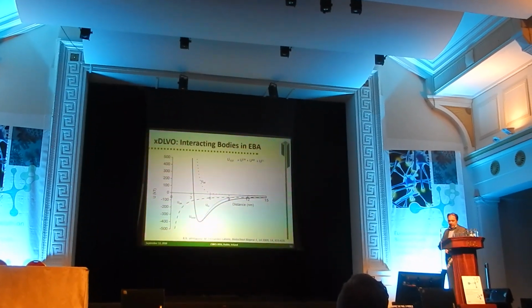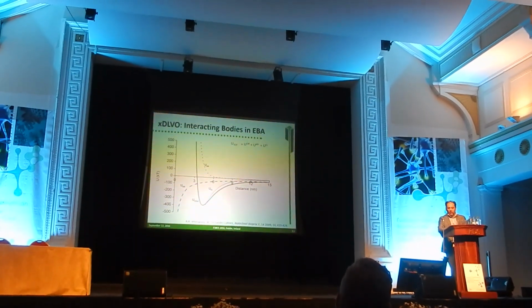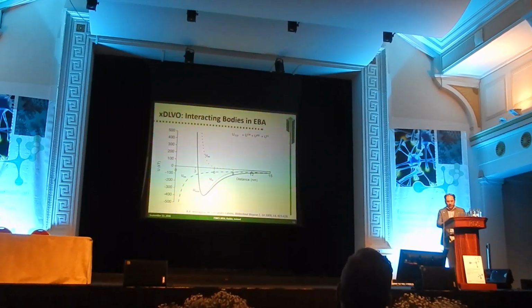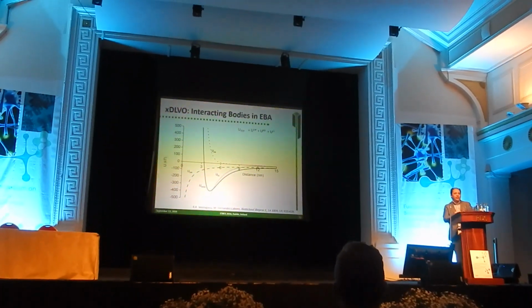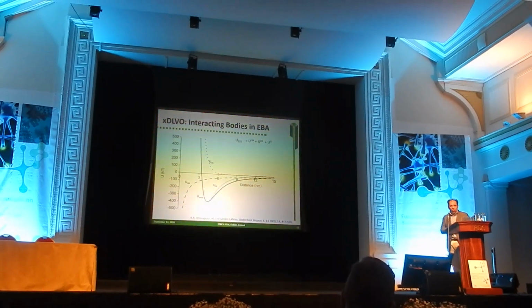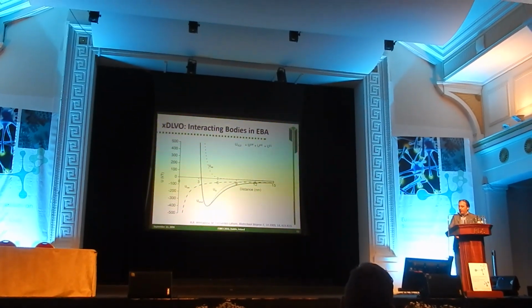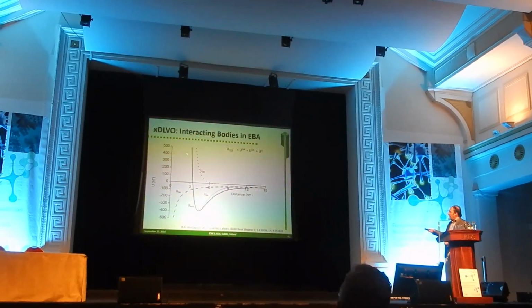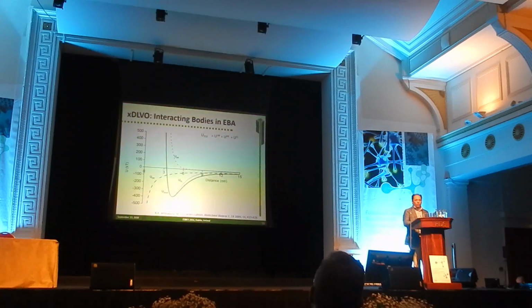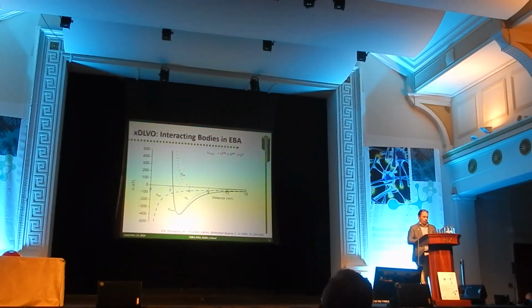When this is negative, this indicates a thermodynamic tendency or preference for these two particles to actually interact, so we could predict adhesion of cells on the material. When the peak is not present here or is even going in this range, right? This will be repulsion and there is no danger of any cell adhesion.